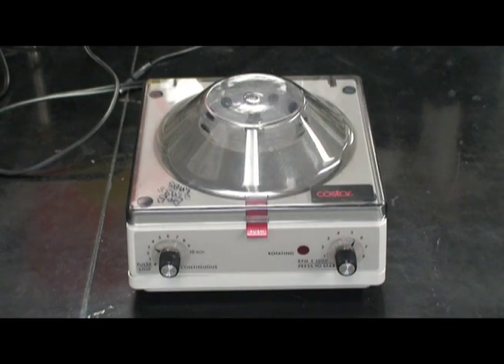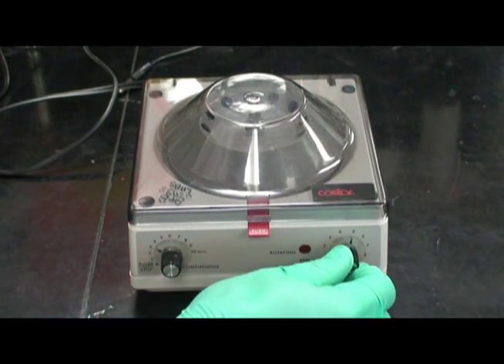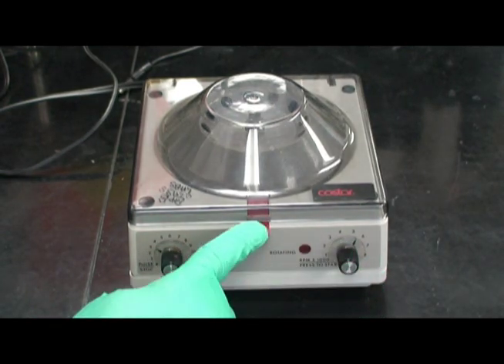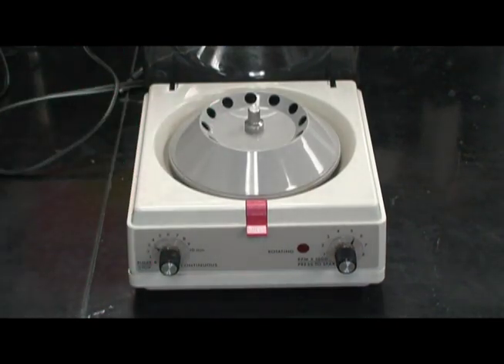This is a smaller microfuge device. Once again, the time and speed can be adjusted by the knobs. To open the lid, press down on the red tab. The current rotor is designed for 0.5 milliliter microfuge tubes.